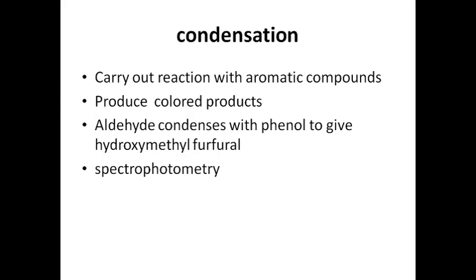hydroxymethylfurfural is the product formed from glucose in hot, strongly acidic solutions. The aldehyde group of this product condenses with phenols like resorcinol, thymol, anthrone, alpha-naphthol, aminophenol, and phloroglucinol.